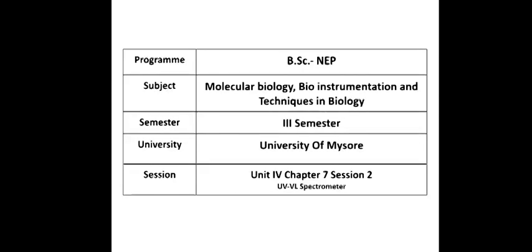Hello everyone, welcome to the next session of Unit 4. In this session, we are going to talk about the UV-Vis spectrometer.